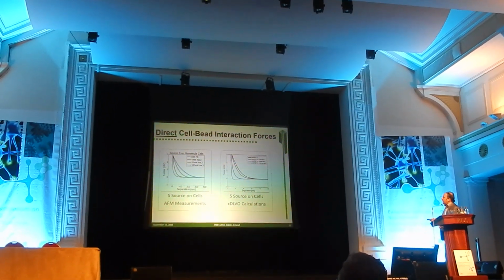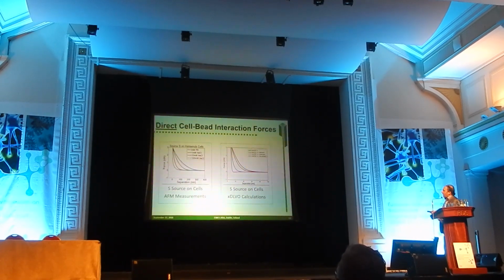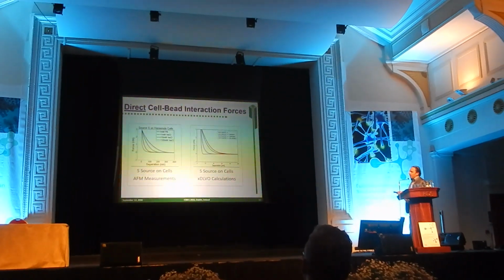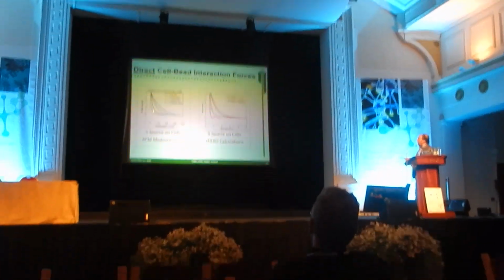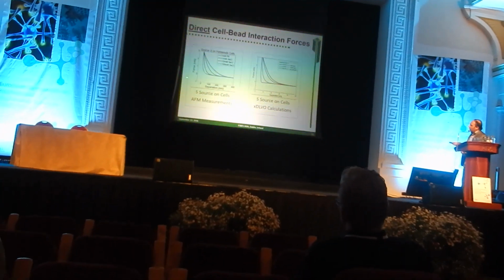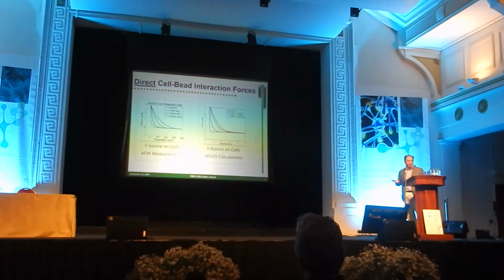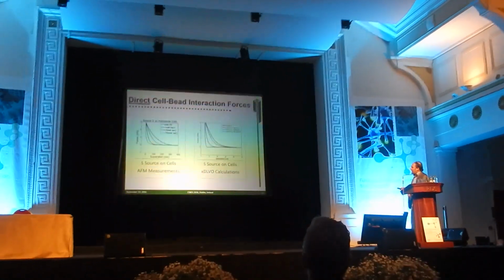trends like these ones. This is, for example, a negatively charged chromatography bead in contact with cells which are normally negatively charged, in this case, these cells. So you see there is a repulsion here, and the more salt you add to the system, so going in this direction now, right? This repulsion decreases because you are masking the charge. And the calculations mimic exactly the same trend.